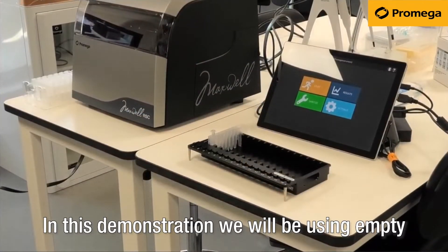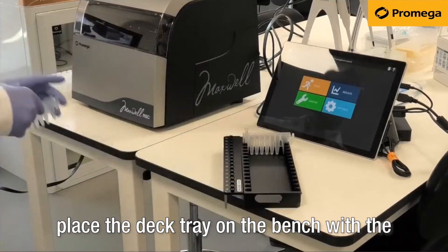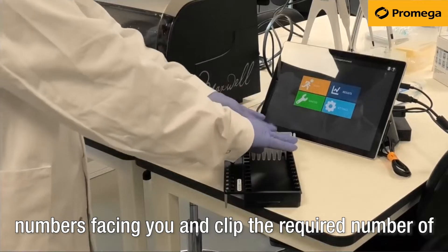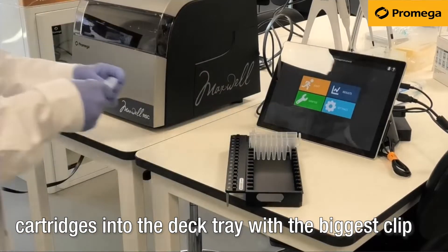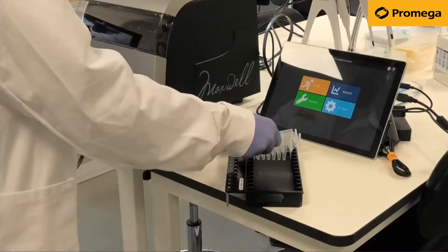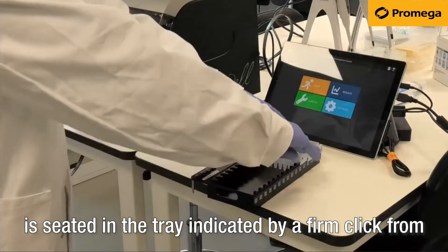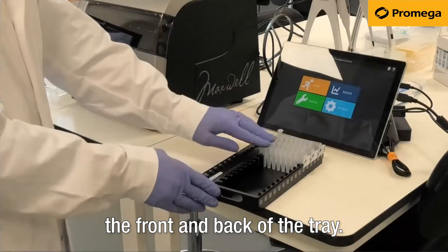In this demonstration we will be using empty cartridges alongside a cartridge with chemistry in. Place the deck tray on the bench with the numbers facing you and clip the required number of cartridges into the deck tray with the biggest clip over the back lip. Press firmly to ensure the cartridge is seated in the tray, indicated by a firm click from the front and back of the tray.